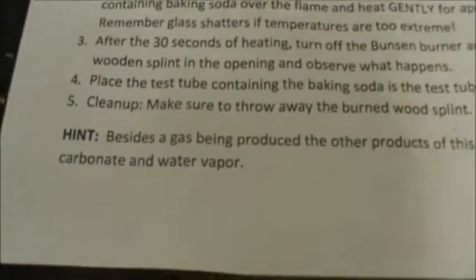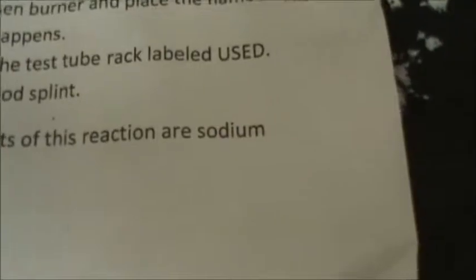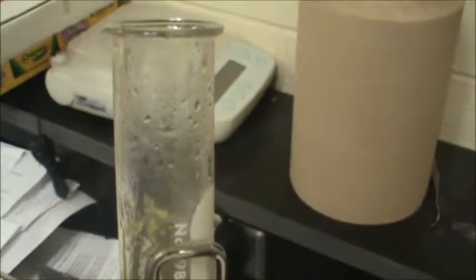As another hint here, we also tell you that there is water vapor being produced, and then there is also a chemical called sodium carbonate. The white powder that you see here, you might notice some other coloration changes. That's coming from the wood. Alright, it's not the sodium carbonate. Sodium carbonate is still white in color, and that's what's present right now in that test tube. And again, we got plenty of water vapor. That's one of our products. Water vapor, sodium carbonate, and some gas that you're responsible for figuring out. Station number 4 is our next reaction.